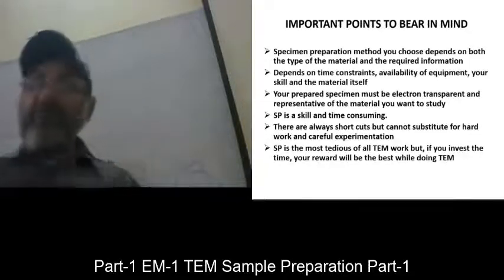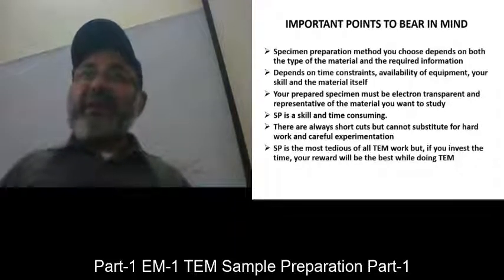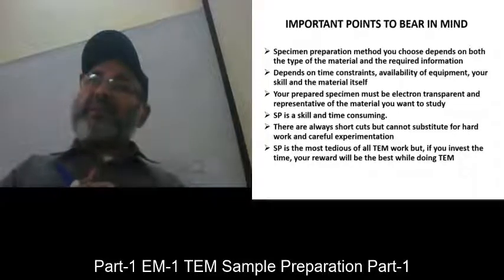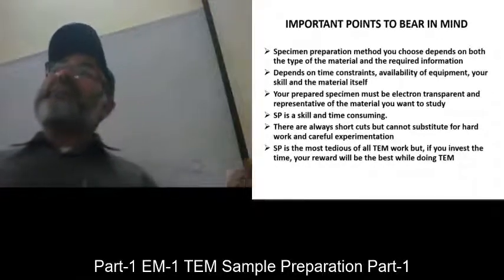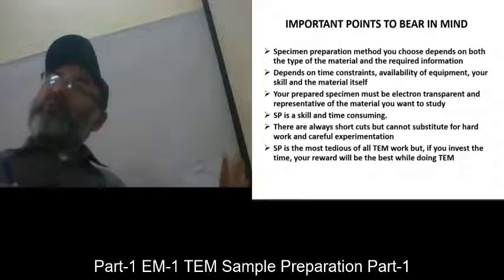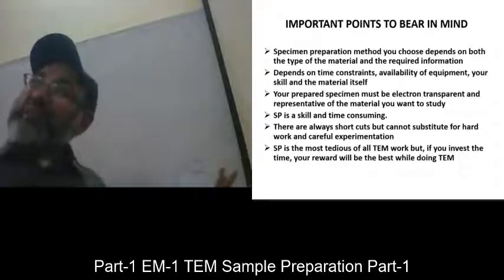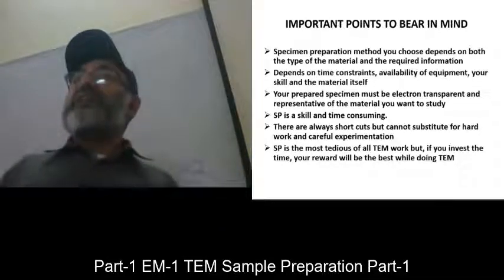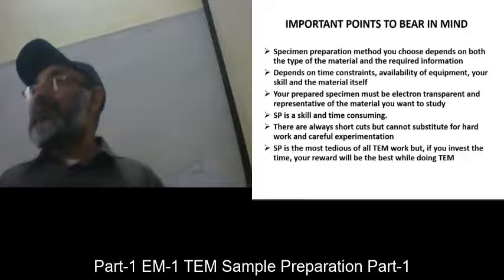So the problem is that the glass is, for example, a silicate glass, and the crystal composition is also comprised of silicates. The glass is, for example, aluminosilicate glass or sodium aluminosilicate glass, and the crystal is aluminosilicate crystal. So the silicon content which you are getting from the crystal is not isolated. The contribution from the glass silicon is also coming there. So if you are expecting, for example, 20% silicon in the crystal, it gives you 30%. So the information is not reliable.